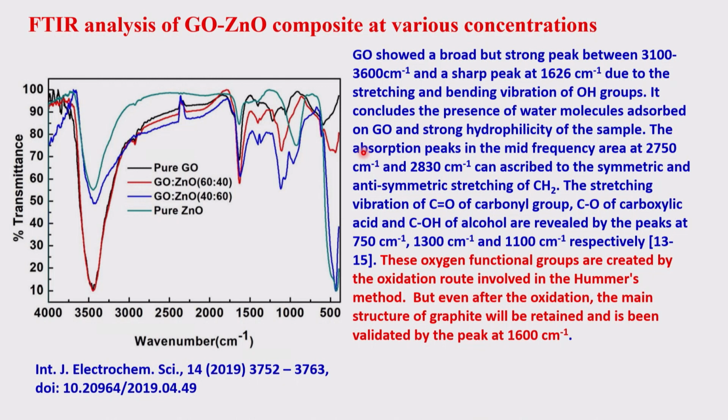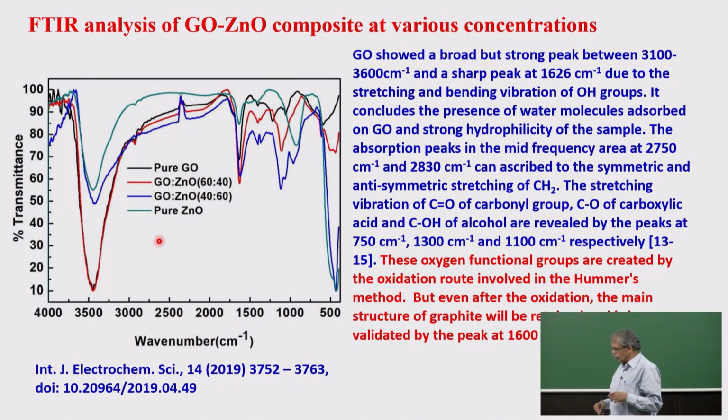Also we can say there are a lot of OH groups, because you are basically functionalizing the graphene oxide to different extents through the oxidation process. The oxidation process will result in hydroxyl, carbonyl, carboxylate, and many related oxo kinds of moieties. So they are all characteristic.